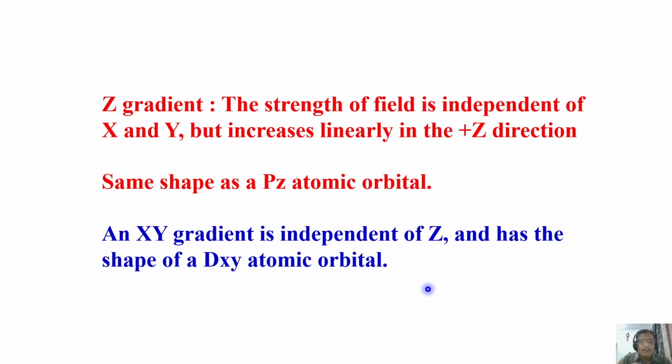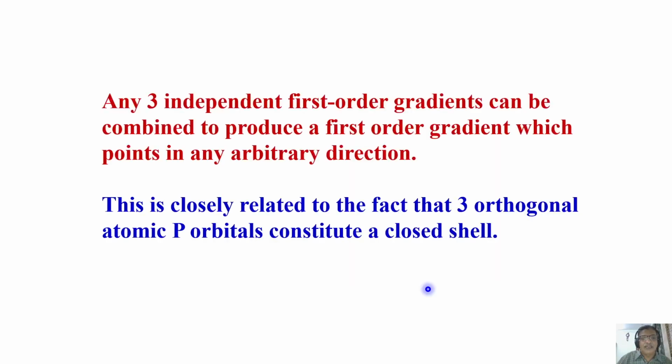Inhomogeneity of the magnetic field: the different shim current spatial profiles produce different magnetic fields with the different shim coils. So you can keep on changing it. You can have three independent shim coils combined together. You can produce a magnetic field gradient in any direction you want.